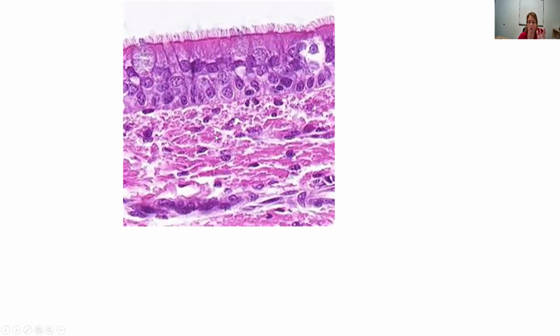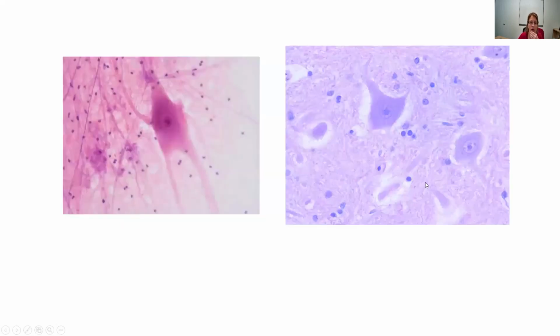Some of this is recognizing things and some of it is narrowing down, knowing it's not this and it's not that. All right, next slides. These are the same thing, but I put them both on here because even though the stains are different and the background area is different, look at these cells. This one over here in the purple and this one over here in the pink.